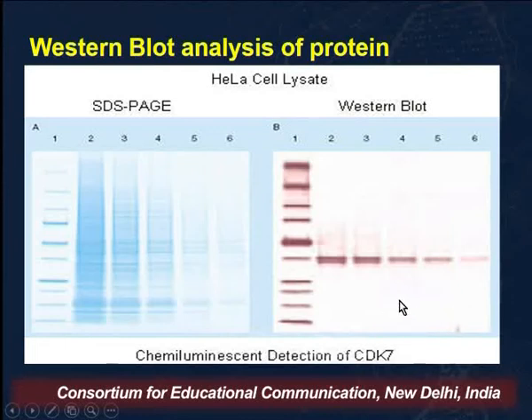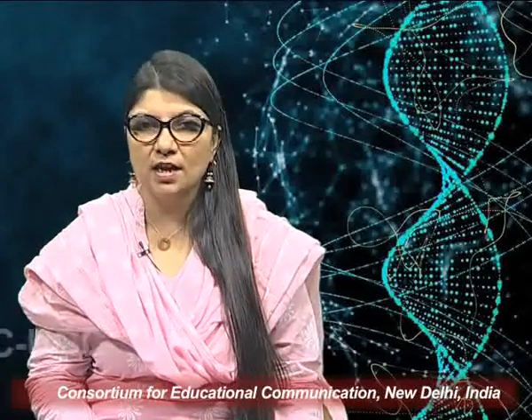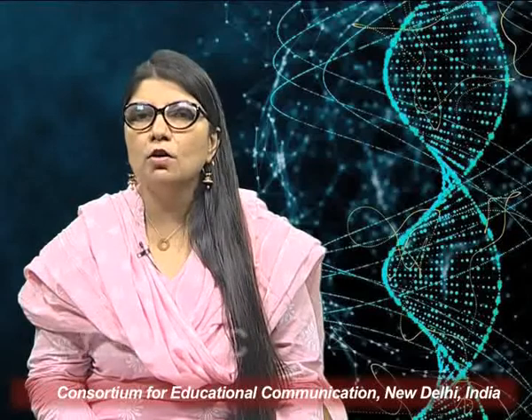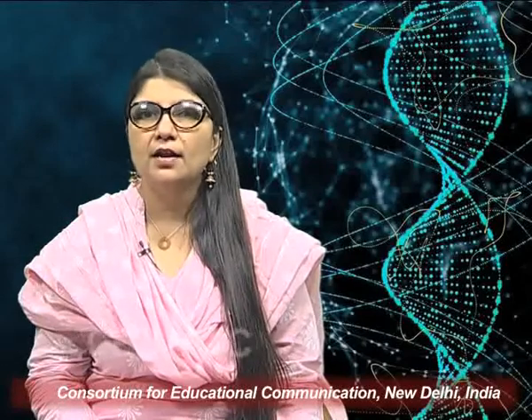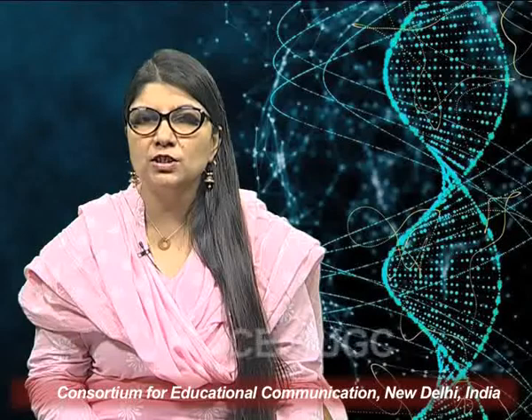And when we get it here, we use the probe, which is the hybridization process. For the hybridization, we can use DNA. We need to specifically target whatever we are interested in, so the complementary base pairing works in the case of DNA and RNA. So you make the complementary probe, which you either synthesize or isolate from some other organism, and then you single strand it and add it to the membrane. It is going to go and bind to the membrane which is present there.